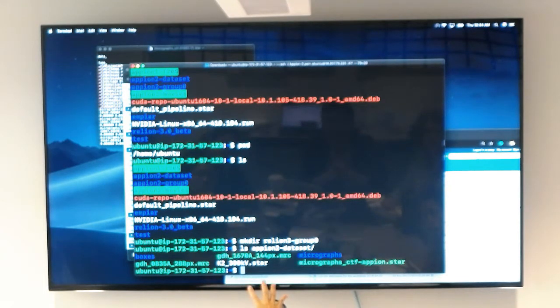In case we don't have time for making initial models, I've already given 2 initial models. One is what I'll consider bin 1, which is roughly a 0.835 angstrom pixel size at a box size of 288 by 288 pixels. And what we're going to be doing today for efficiency is bin 2, which will be 1.67 angstrom per pixel at 144 by 144 pixel box size.